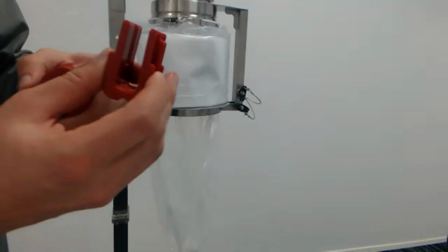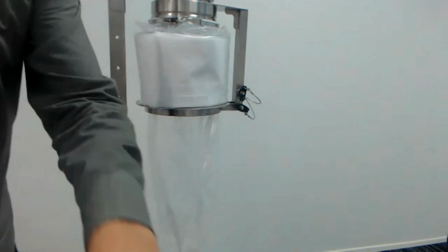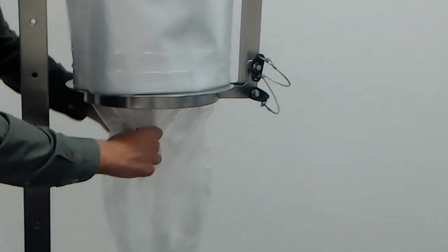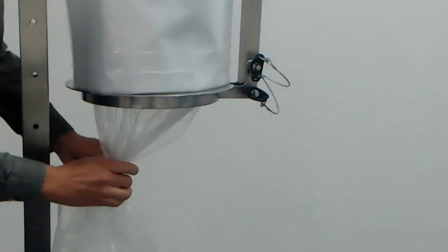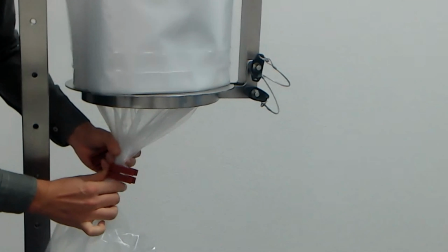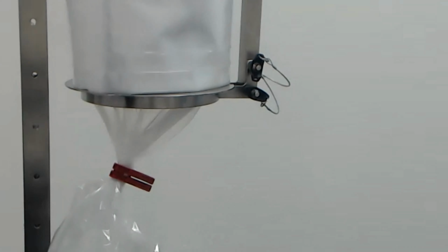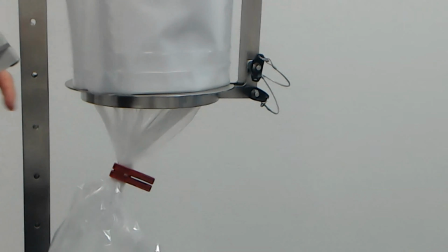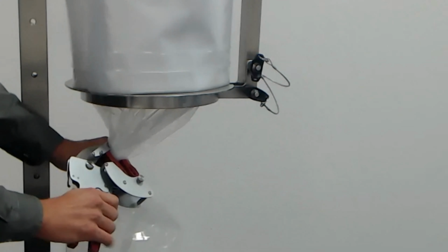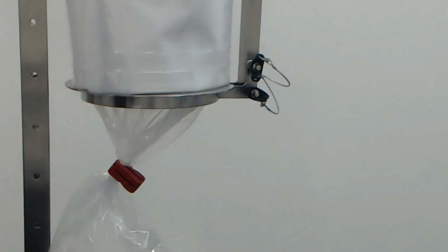There are two parts. I have one part with the opening, and I have the other part with the stamp. On the opening, I can zoom a little bit, maybe. I just take the fill material together, then I use the crimp to insert the fill material in there, like that. The other part I just press together by hand, and then there are two different tools available. So I have the pressing tool here for the first step. So I press the crimp together so that the closure is really pressed together strongly enough.